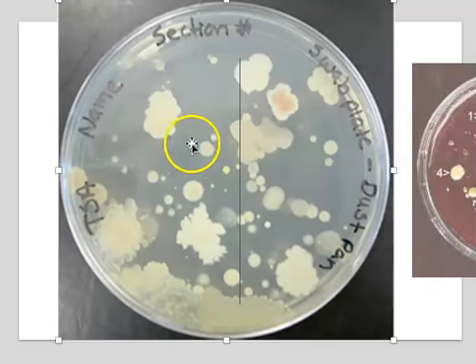There's a tremendous variety of size and shape on this plate. There's some kind of organism growing over here that doesn't really look like a colony. It's all just sort of merged and growing over this large area. This is a reminder to us that bacteria are not the only organisms that can grow on a nutrient agar plate.